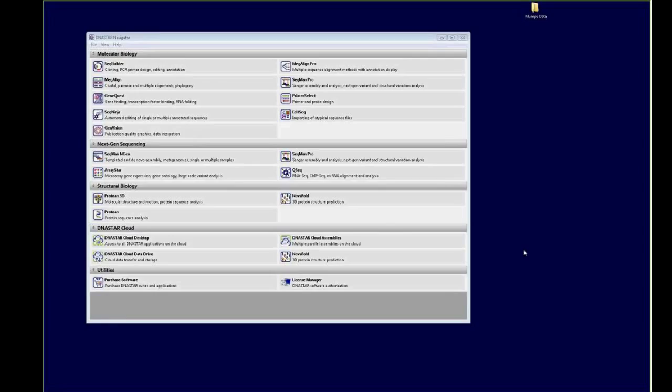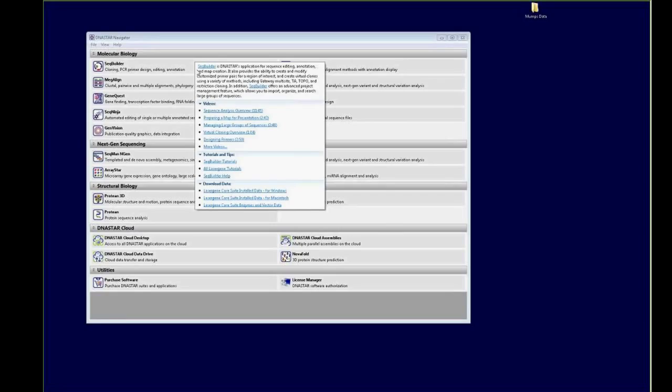Yeah, that's a great question. So SeqBuilder is mainly focused on PCR primer design. And as you saw, there were just a few options designed to make the primer design as simple as possible. Primer Select is used for more general primer and probe design. And additionally, Primer Select has a lot more advanced options. So if you're really heavy into primers and you need to be able to access more of the advanced options, you can go into Primer Select and design your primers there. And then you can actually build primer catalogs. So any primers that you design in Primer Select, you can use those in SeqBuilder. So the idea is just to make it as streamlined and simple as possible. But for those that need the advanced tools, we provide that as well. And we also have capabilities to create sequencing primers, which I'll get into a little later.